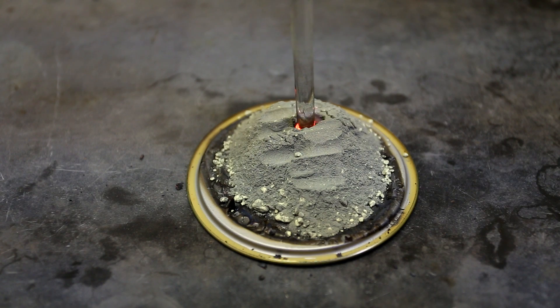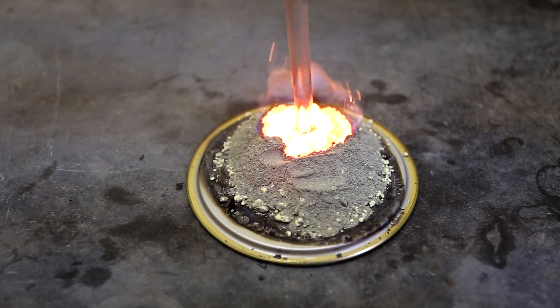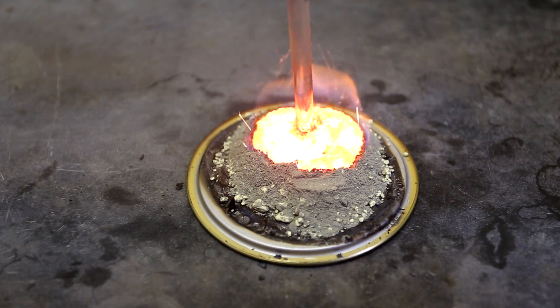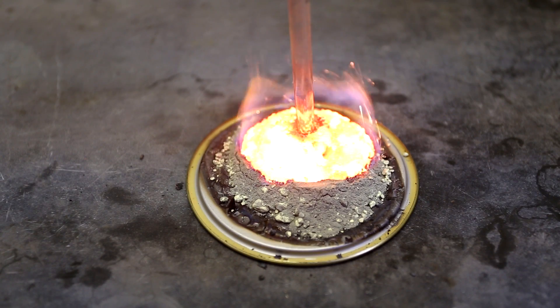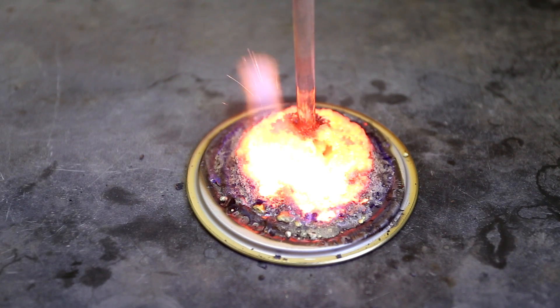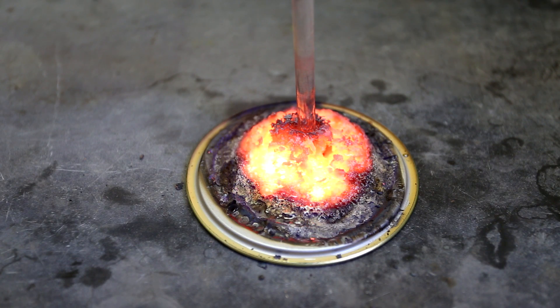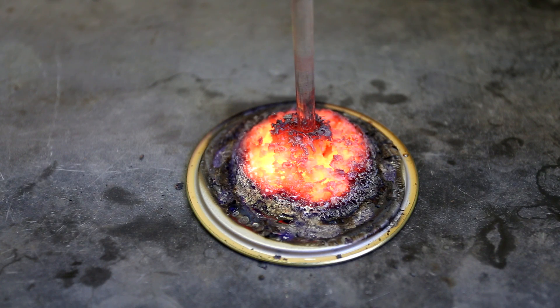This reaction is interesting, but the final product, iron(II) sulfide, is actually a useful product. The iron sulfide from this reaction can be collected and reacted with hydrochloric acid to produce hydrogen sulfide gas. It has a rotten egg smell and it is extremely poisonous. Its toxicity is comparable to that of hydrogen cyanide. However, despite its significant toxicity, hydrogen sulfide gas is used in a multitude of chemical processes.